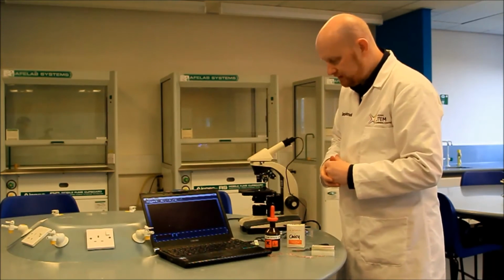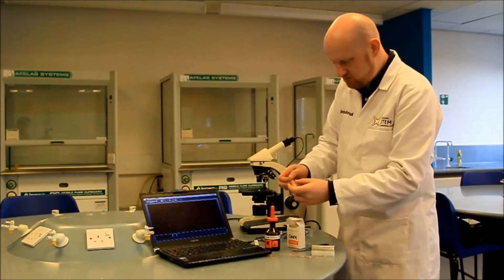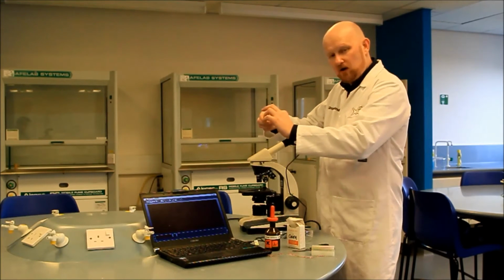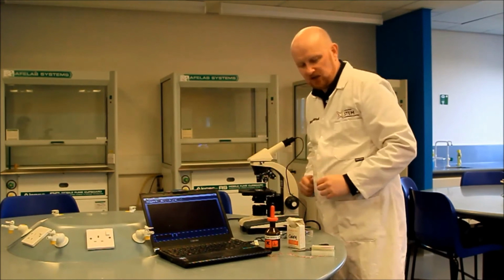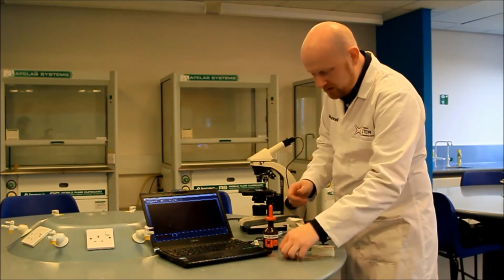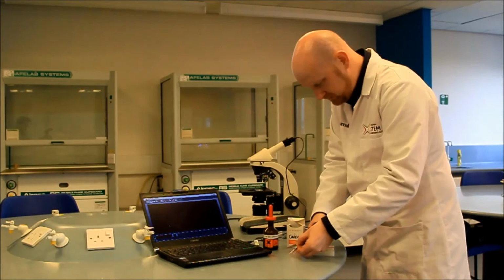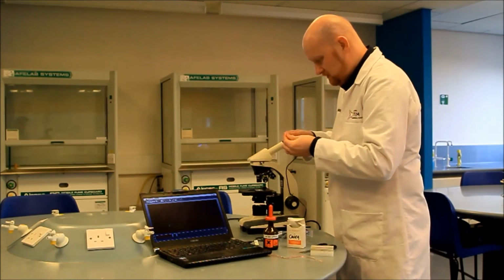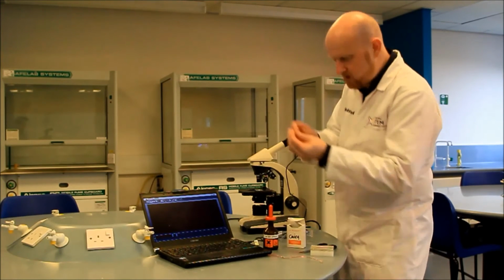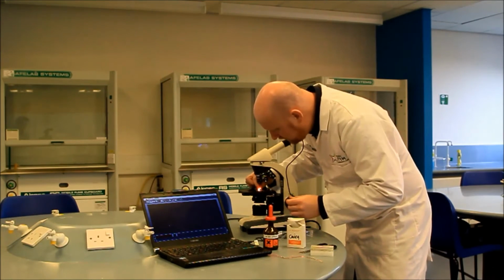So, what we're going to do, we're going to take our cavity slide, making sure the cavity well is on the top there. Place that on our stage. I'm then going to take a piece of the copper, just a very small piece, about a centimetre in length. Oop, haven't picked it up, there we go. And I'm going to place that on the slide, on the cavity area.